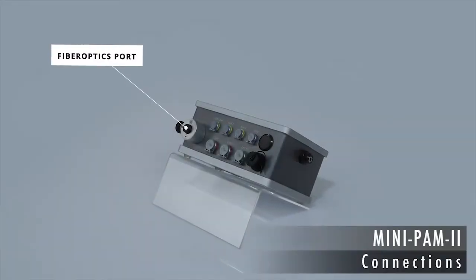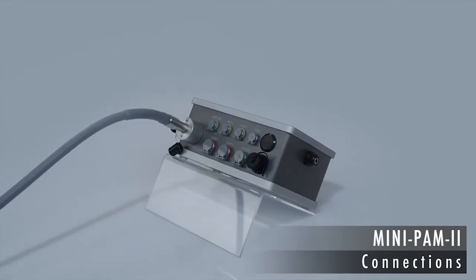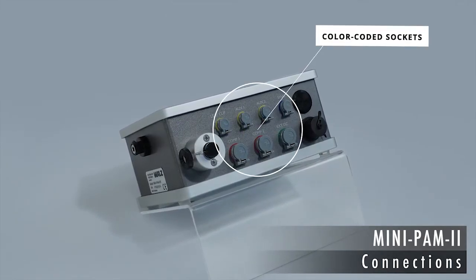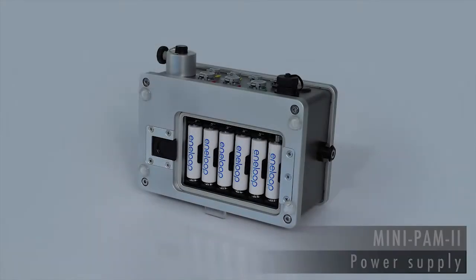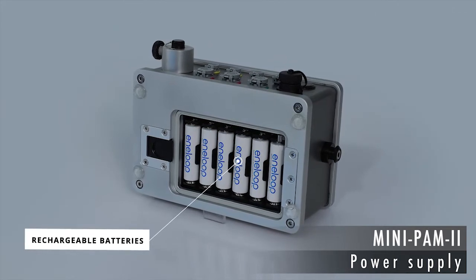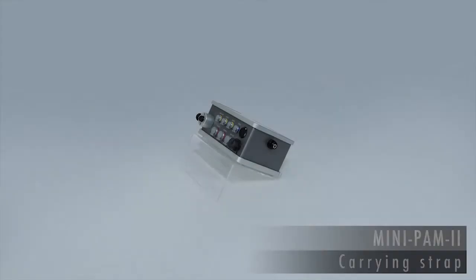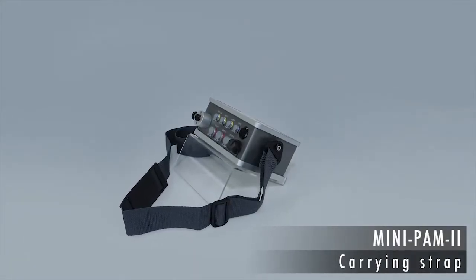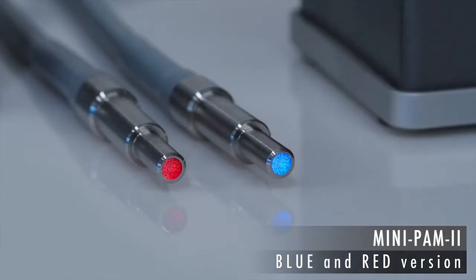A high-transmission fiber optic cable connects the MINI-PAM2 to the sample. Color-coded sockets and plugs reduce the risk of mixing up connections. The MINI-PAM2 can be powered by widely available type AA rechargeable batteries. The carrying strap greatly enhances portability and keeps the hands free for manipulations. The MINI-PAM2 is available with a blue or red measuring light.